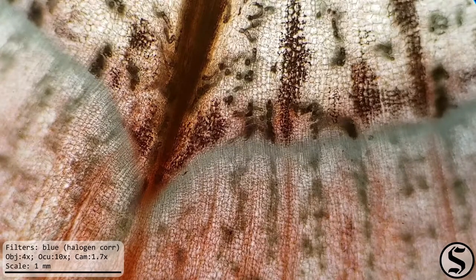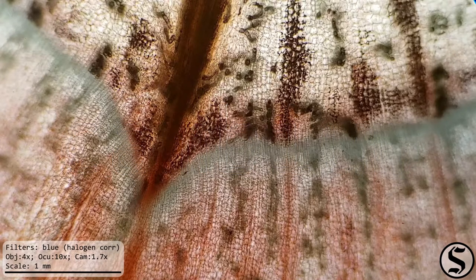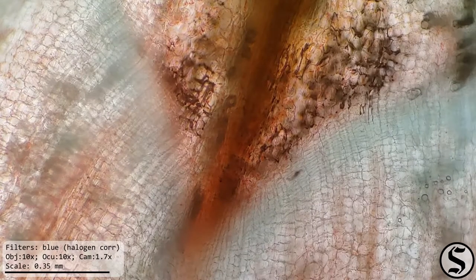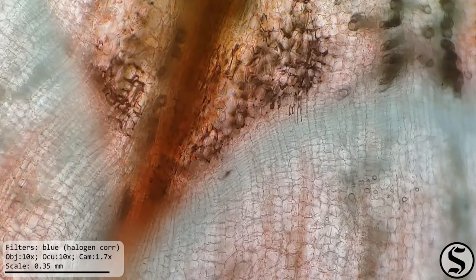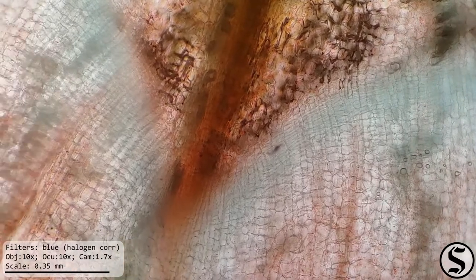Zooming back out again, we're looking at the cambium now. That's the tissue between the wood and the bark, from the Latin root meaning change. This is the part of the plant responsible for most of the growth. You can tell that it has much more dense packing of cells in here, and we can see that even better at higher magnification. So when you're looking at tree rings, that growth is happening in the cambium as it experiences seasonal changes in environment and alters its growth rate accordingly. And at an even higher power objective, we can see them even more clearly.